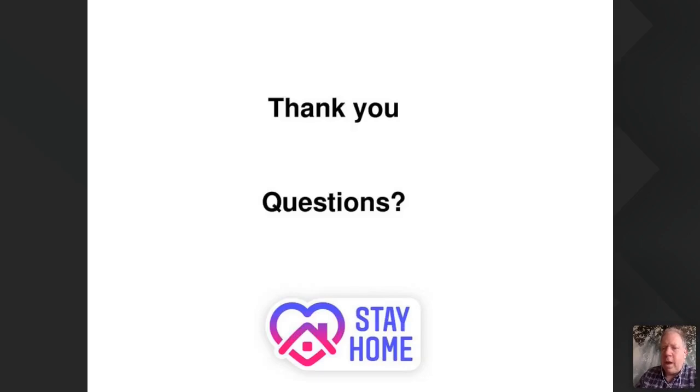Okay, thank you, Ali. Thanks for coping with our technical details. Let's hope Webinar Jam isn't run by a neural network. I think we've got one question here. Laurent Thomas asked, was the classification for the full image or cell by cell? Yeah, it's a single cell classification. We classify cell by cell.